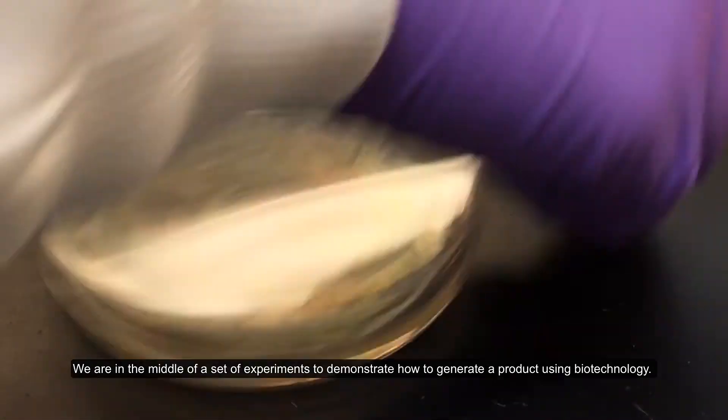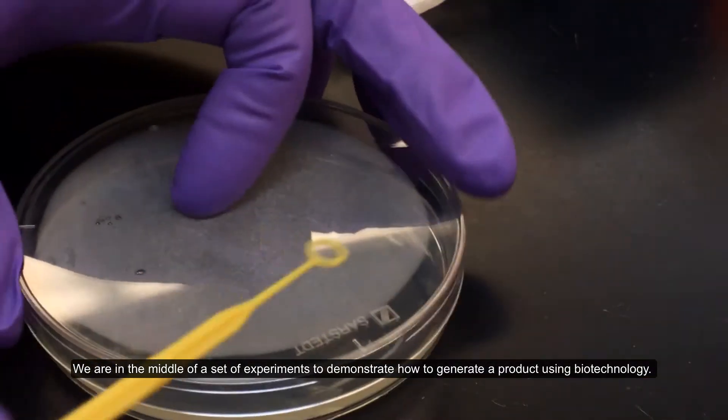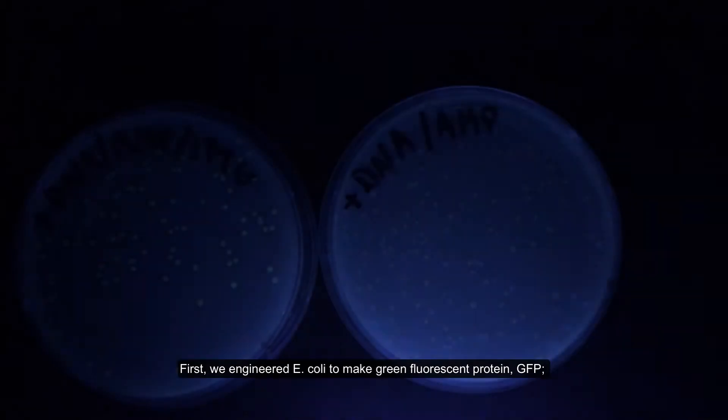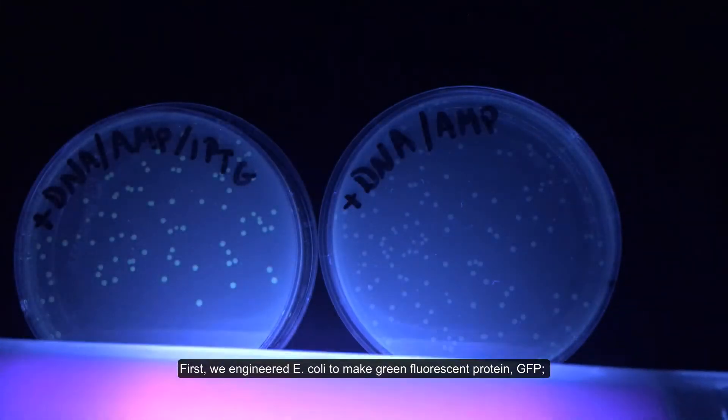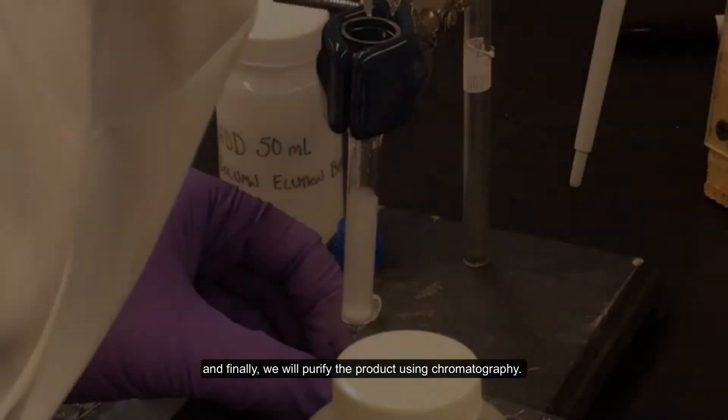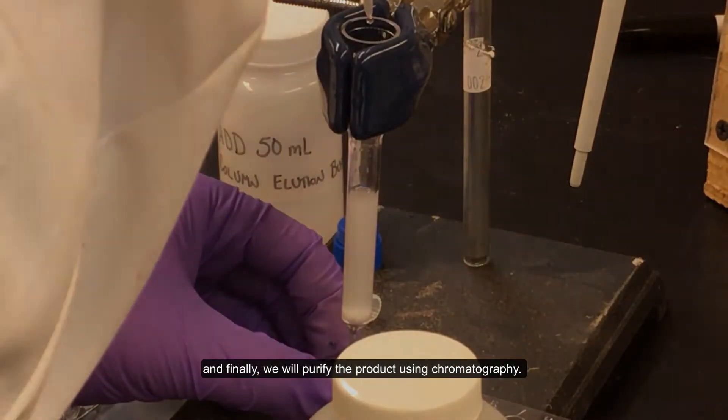We are in the middle of a set of experiments to demonstrate how to generate a product using biotechnology. First, we engineered E. coli to make green fluorescent protein, GFP. Next, we will scale up production using cell culture. And finally, we will purify the product using chromatography.